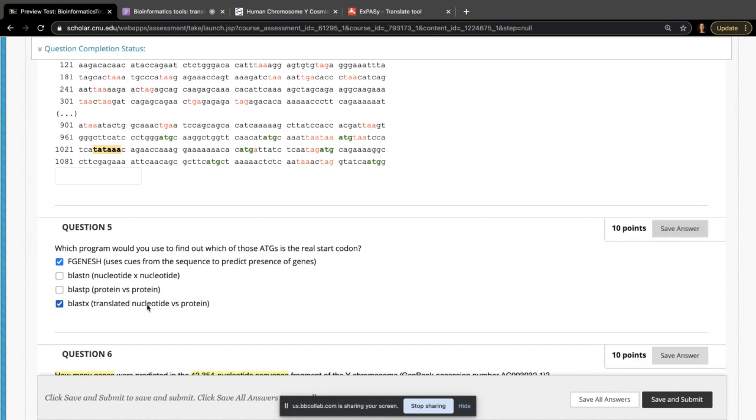All right, so the last one: you have a nucleotide sequence, and then the computer would translate your nucleotide sequence into six possible frames. That's what is meant by translated nucleotide. You're only entering the nucleotide, and the computer is doing the work of making the six possible ones. And then it compares each of those six protein sequences, which are all virtual, you don't know if any of them exists, to a protein database, which is protein sequence that we know exists. So somebody else sequenced the protein, I know the amino acid sequence of that protein, so it's deposited in this bank of protein sequences.